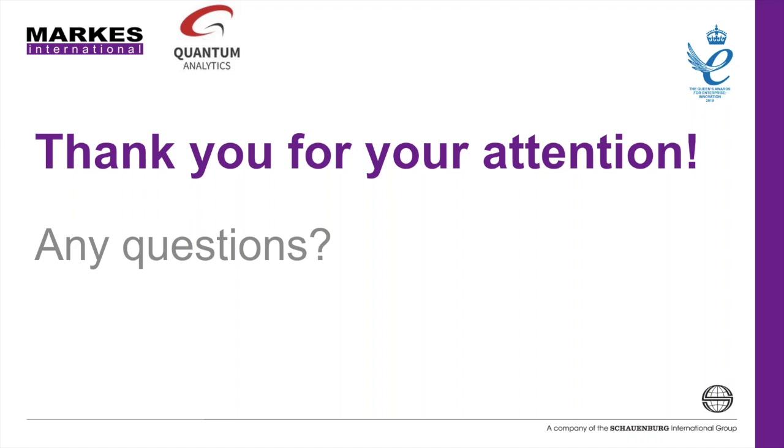Fantastic. Let's try this one. Why is recollection useful for air samples? Now, recollection is useful for a couple of reasons.